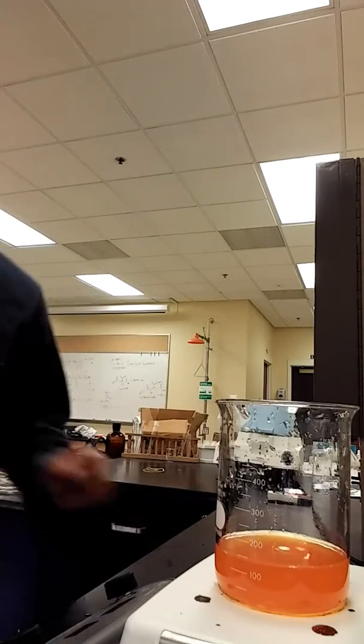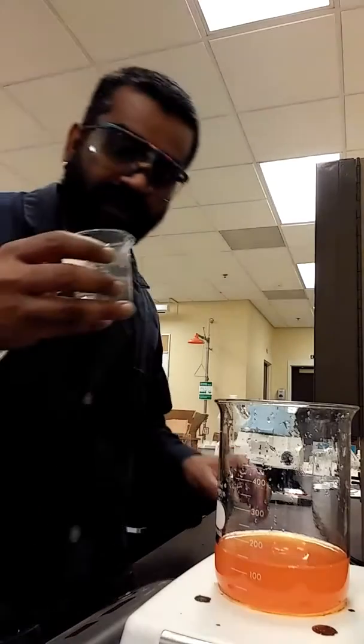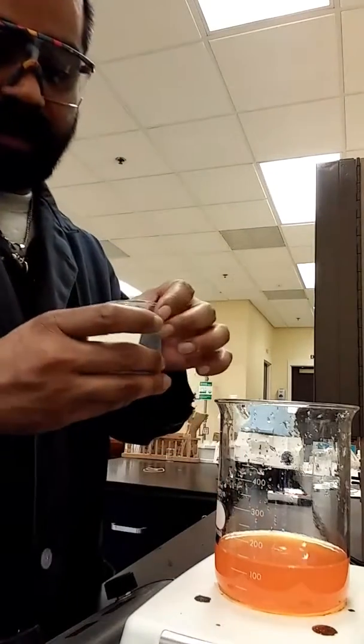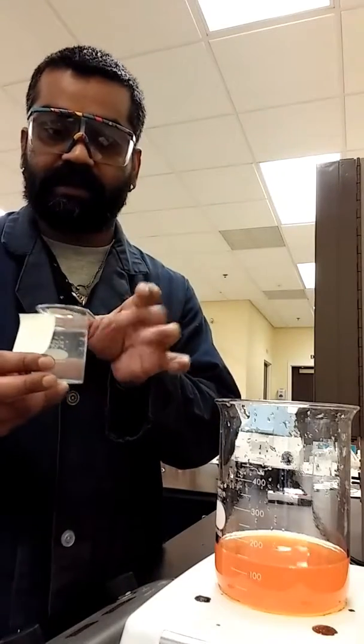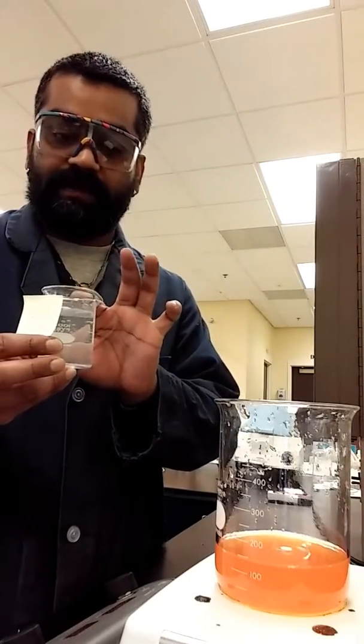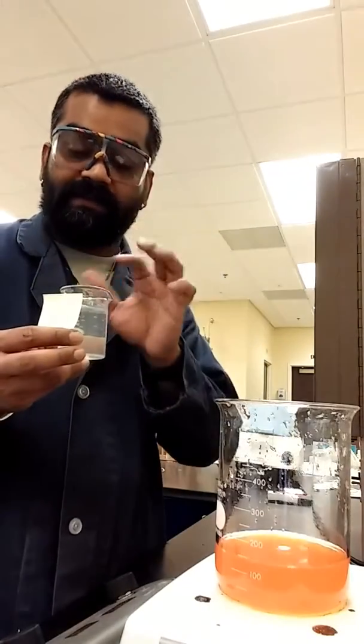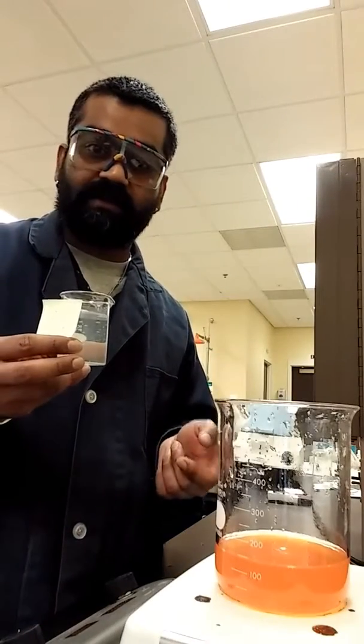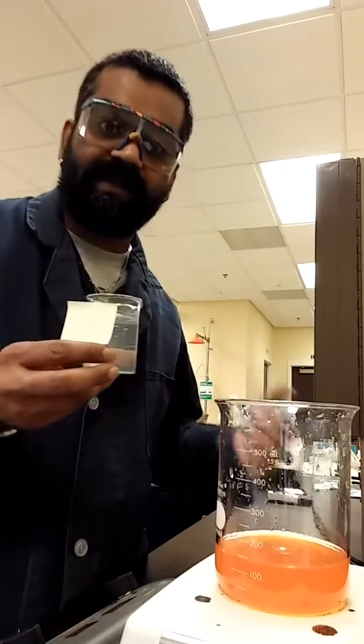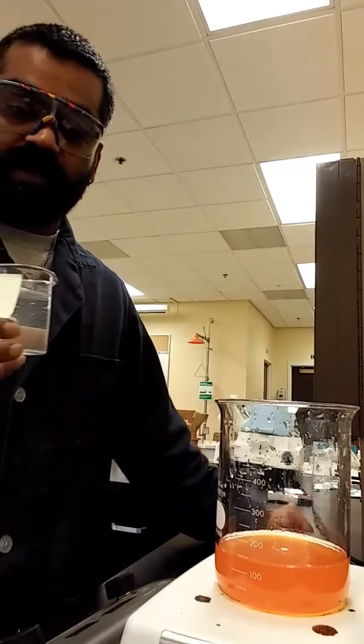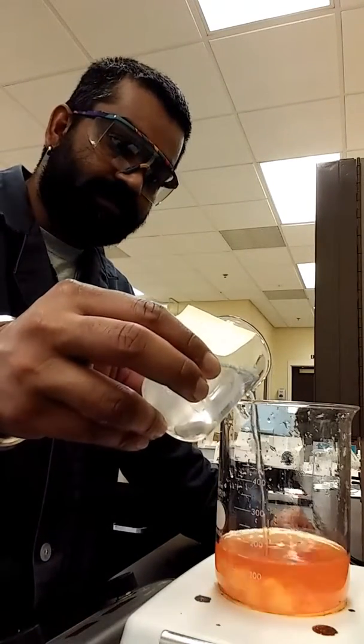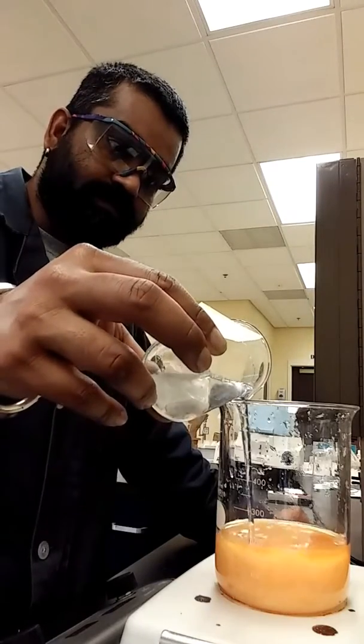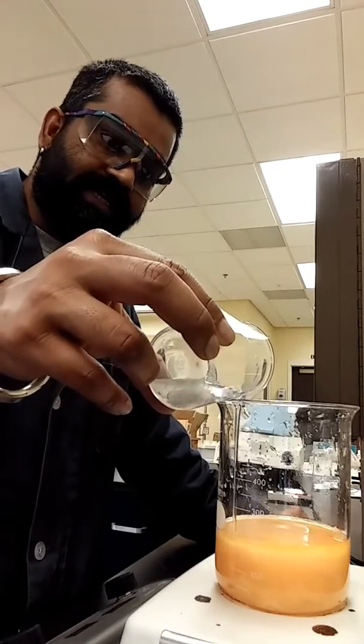Now we're going to add some calcium chloride. I will be providing the stock solution to all my students so that they can go ahead and add the entire batch of it in here. Here I have about 28 grams of calcium chloride in about 75 milliliters of water. So we're just going to add all of this in here.